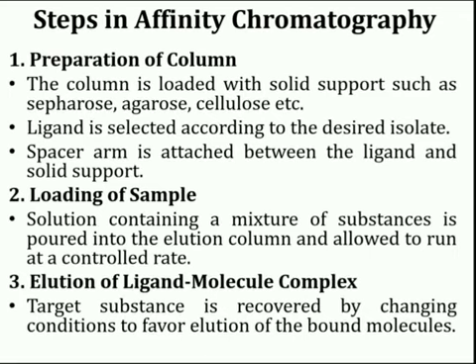As I discussed earlier in the last slide, spacer arm is usually a chain of carbon and or other atoms that keeps functional groups away from the solid matrix.